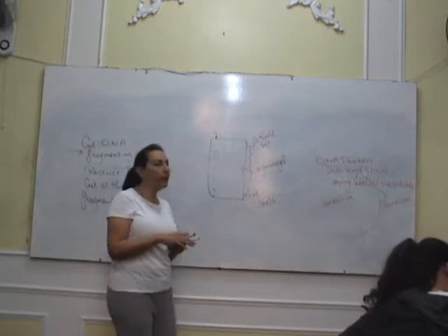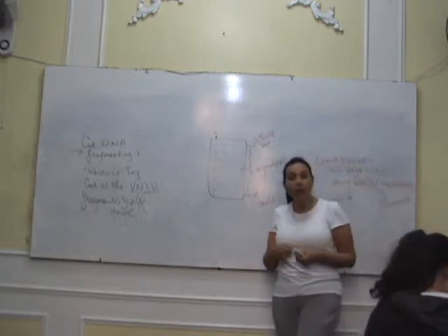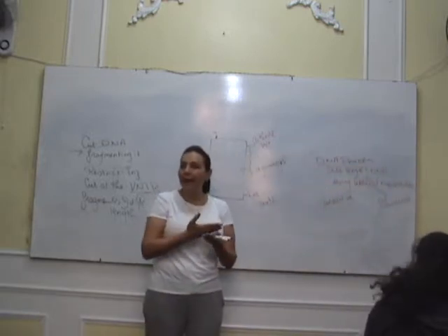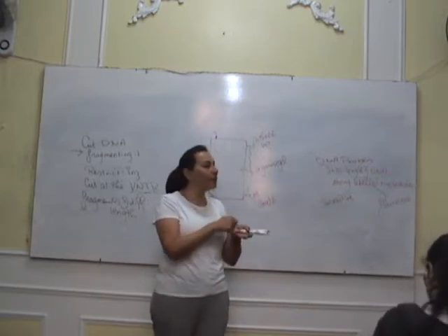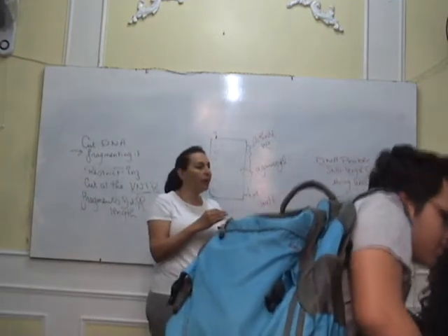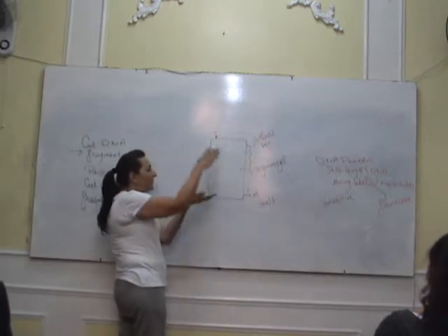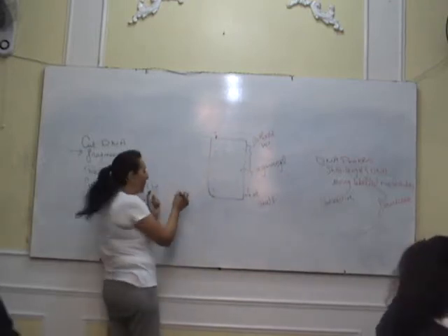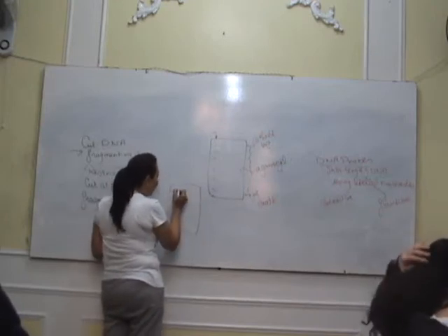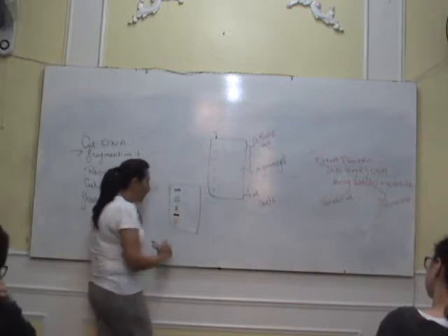We are relying on the fact that bases join by the complementary base pairing rule. So the probes will start to move and bind with the complementary bases. If it's a probe made with radioactive nucleotides, this is going to print black on X-ray film. If I put an X-ray film on top of this absorbent paper, the X-ray film will have black bandings, and those are the DNA patterns for this individual.